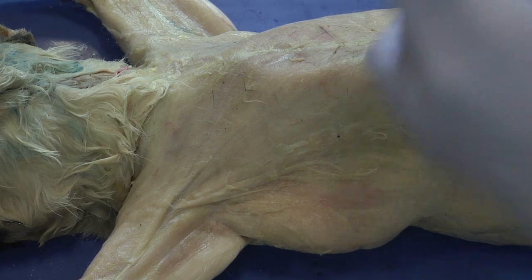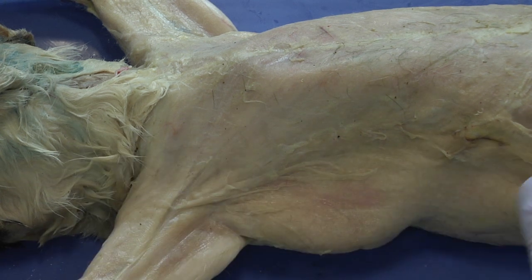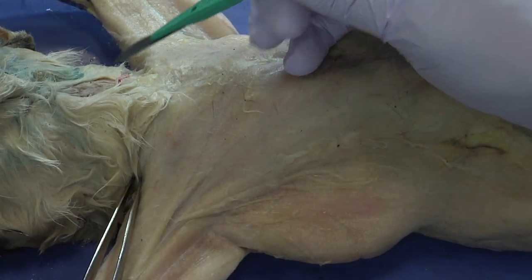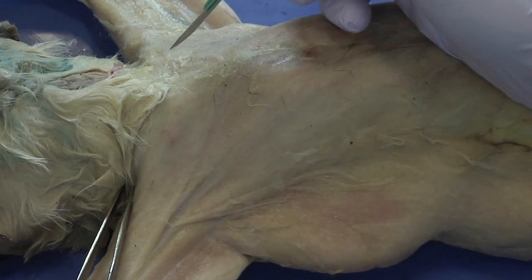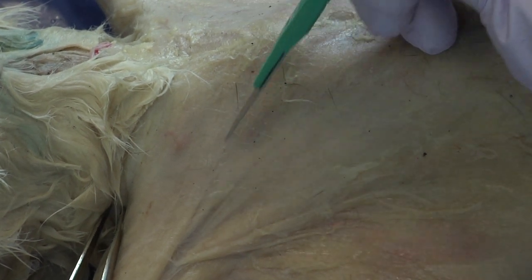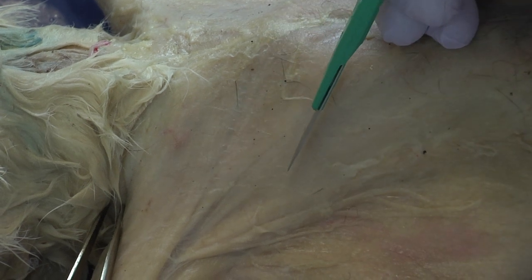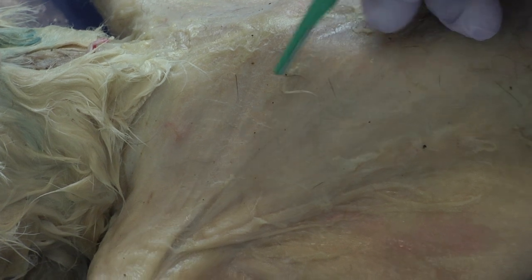I also want to use my forceps just as a grip, never wanting to put my finger in the area where I'm going to be using the scalpel. I'm going to very carefully, in one smooth motion, create a line that separates just following along the natural separation between these two muscles — and that seems to be about there.